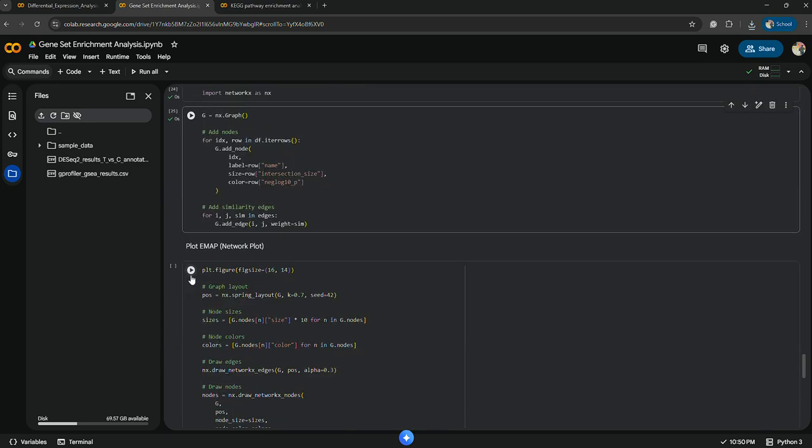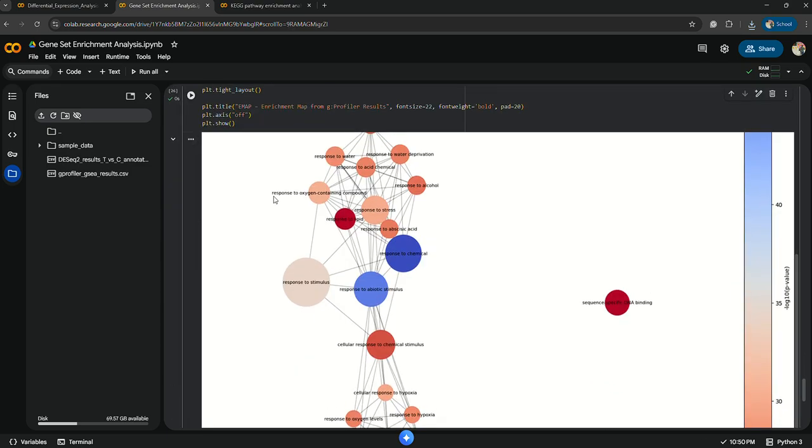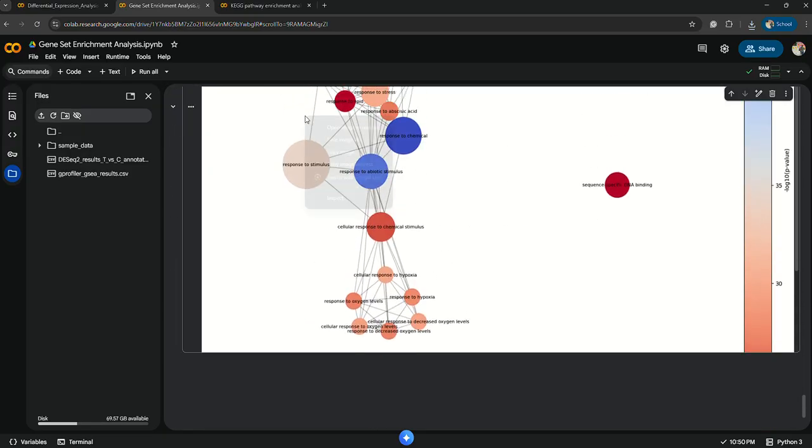Now we need to plot it. This is the plot. You can simply save it.